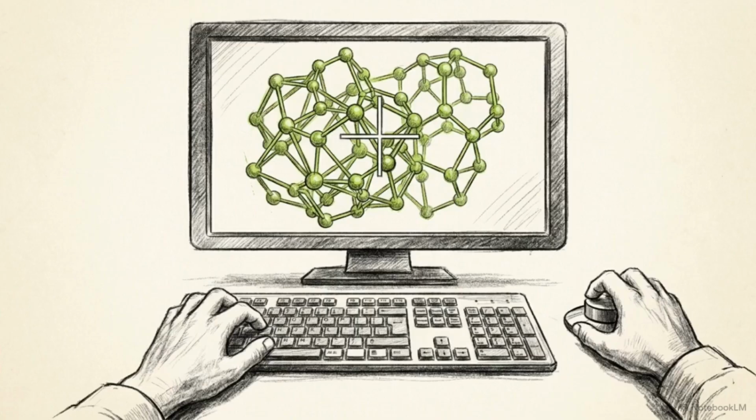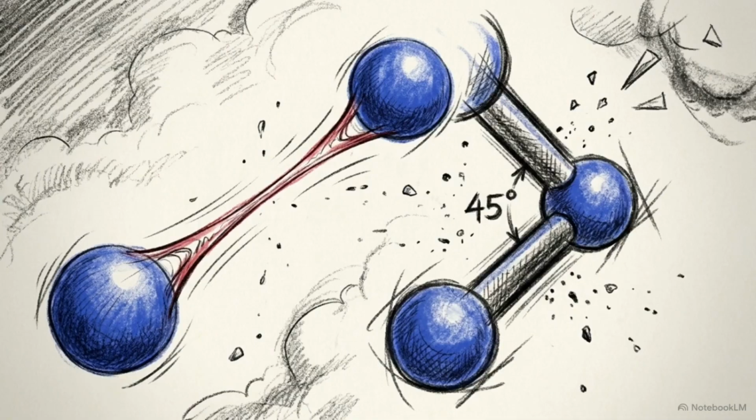With a clean map established, the crystallographer steps in. They use real space graphics to manually trace the amino acid sequence into the new density. This human-led rebuilding fixes the large topological errors, but it inevitably introduces countless microscopic geometric flaws, like stretched bond lengths and implausible torsion angles.